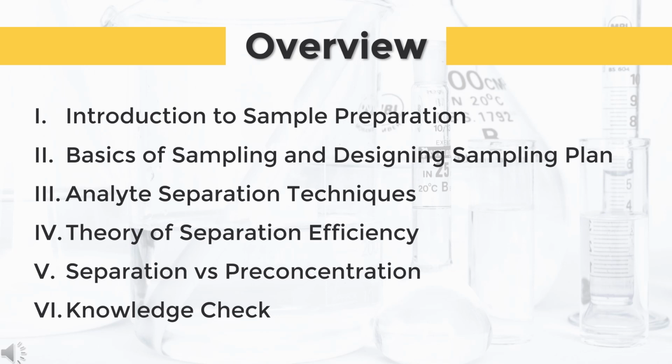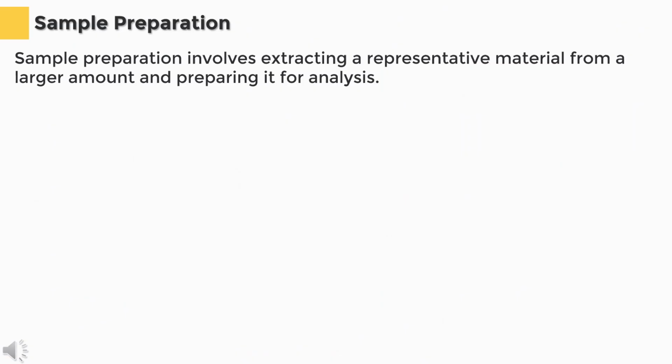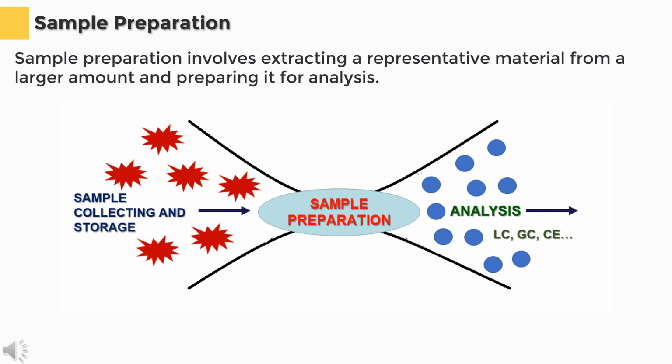But before that, I will provide a brief introduction of what is sample preparation in analysis and its importance. So what is sample preparation for analysis? Sample preparation involves extracting a representative material from a larger amount and preparing it for analysis.